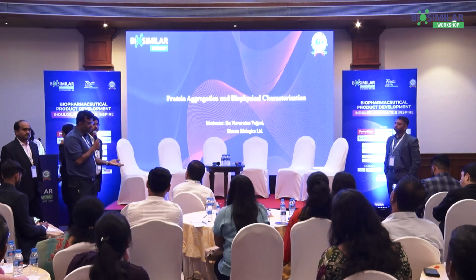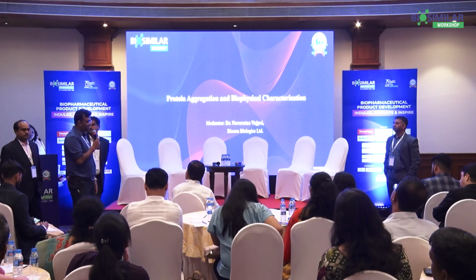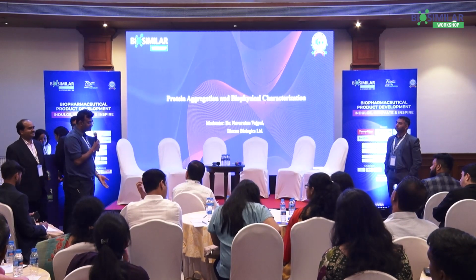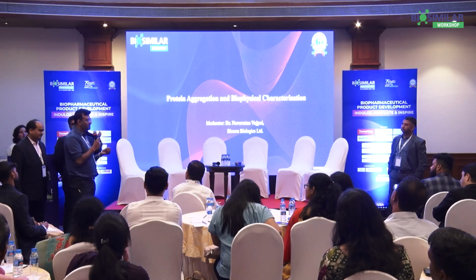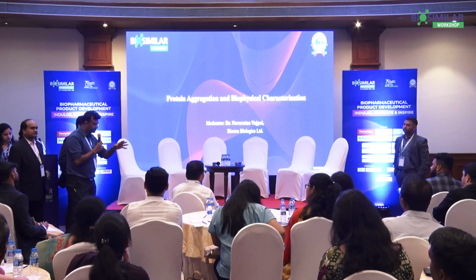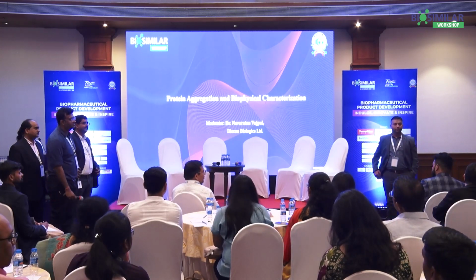Now the USP chapter also talks about life cycle management, where the QbD approach for analytical method development has also come into the picture. So all of these may help us in defining some sensitivity in the CD as well. I hope that answered part of the question. Thanks for that. I have another question.